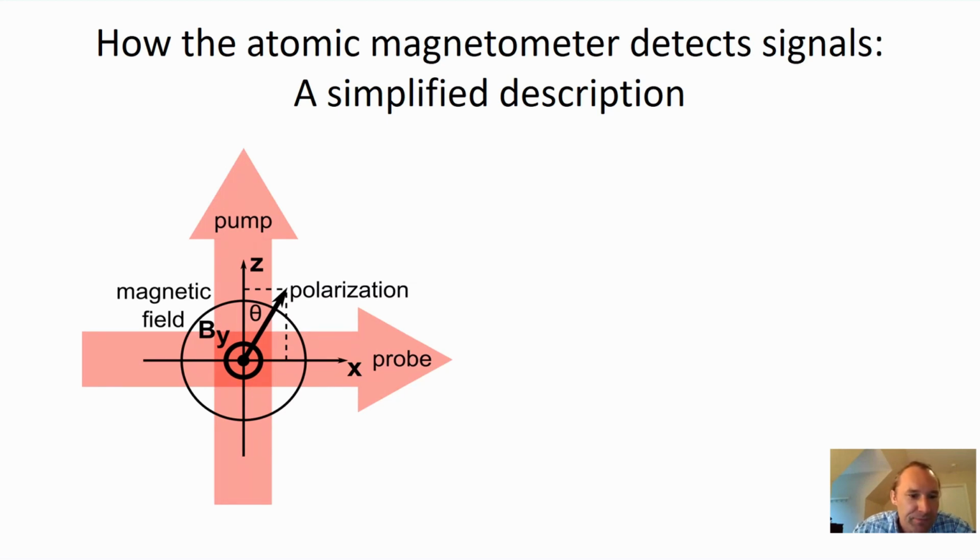If you do that, then this magnetic field will act on the spins that are along Z, and will start rotating them by some angle theta. And the reason why it doesn't keep going, like your typical imagination, where you turn on the magnetic field along Y and the spins just start precessing in a circle around and around and around, is that it does not happen that way.